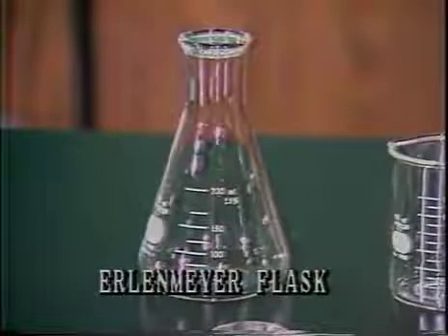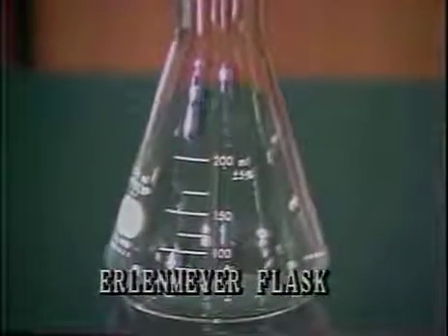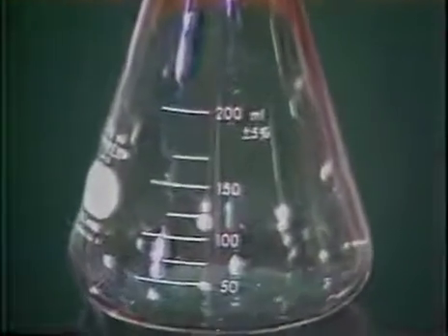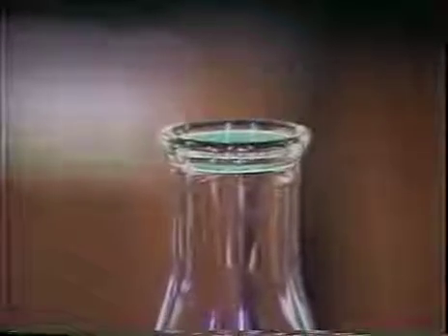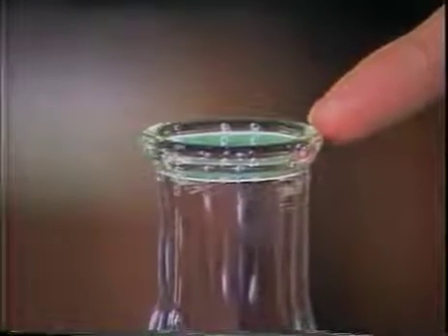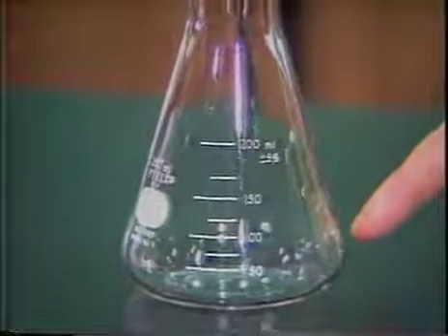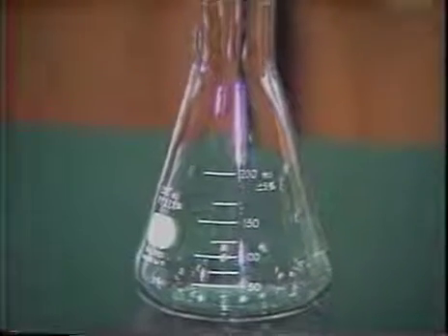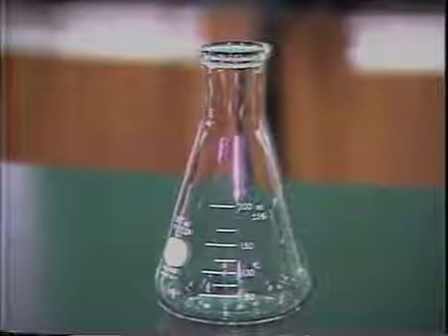This Erlenmeyer flask also shows volumetric gradations. Erlenmeyer flasks, as you remember, are used to mix or swirl liquids, and therefore they have a narrow mouth to prevent spills and a broad base to contain the liquid. These gradations are not particularly accurate and are used only for approximate measures of volume.